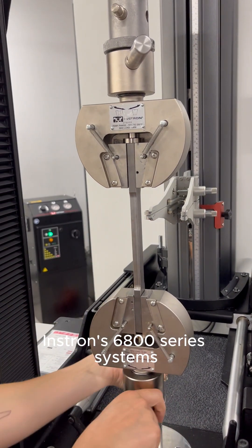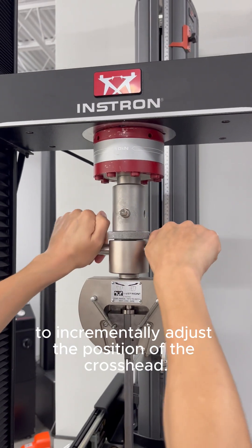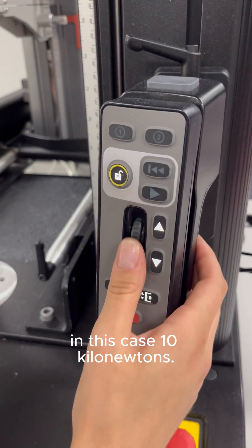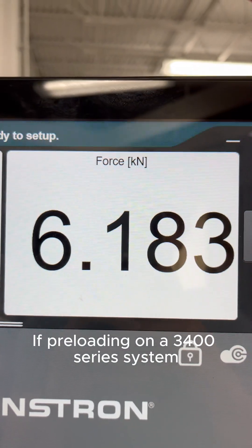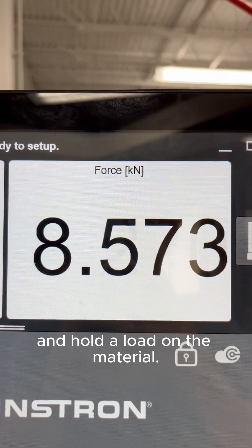Instron's 6800 series systems have a fine-tuning wheel to incrementally adjust the position of the crosshead. Use the fine-tuner to bring the specimen to the frame's capacity — in this case, 10 kilonewtons. If preloading on a 3400 series system, a method will need to be created to slowly apply and hold a load on the material.